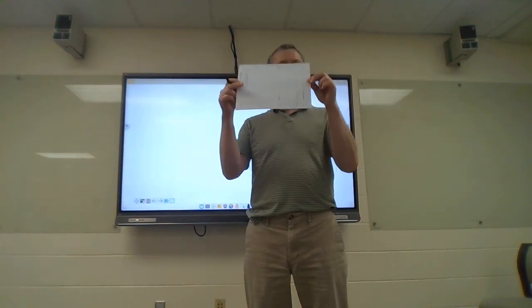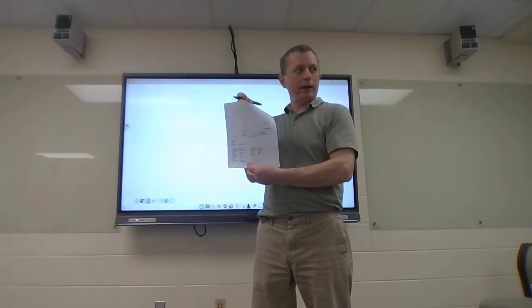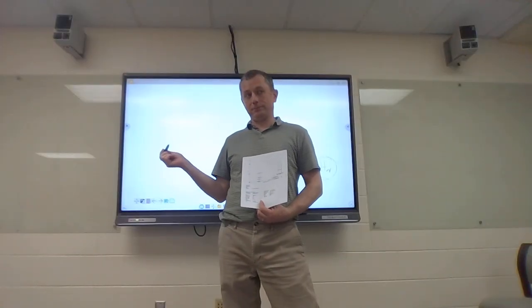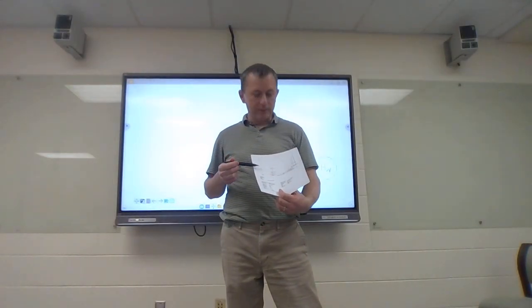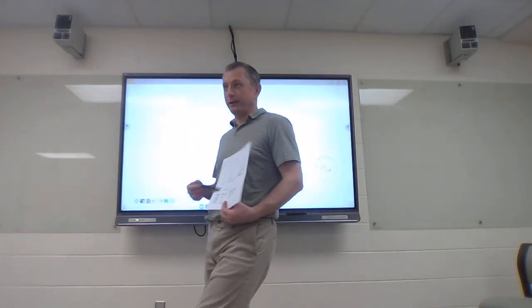Okay. So molecular formula. I would go to the IR on the back for that one. And what do we notice in this IR? Unlike the last one, nothing in the OH, right?